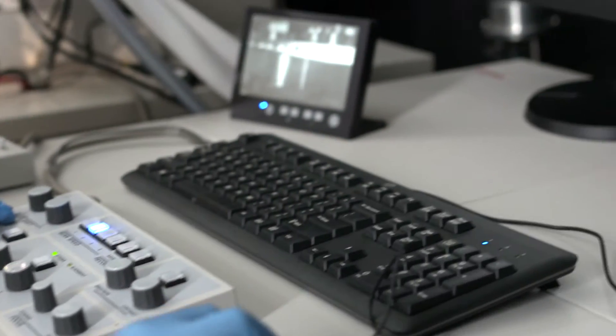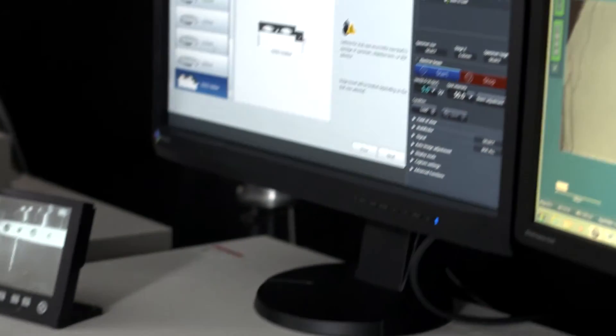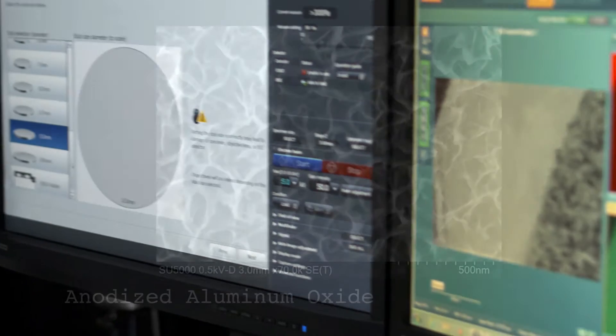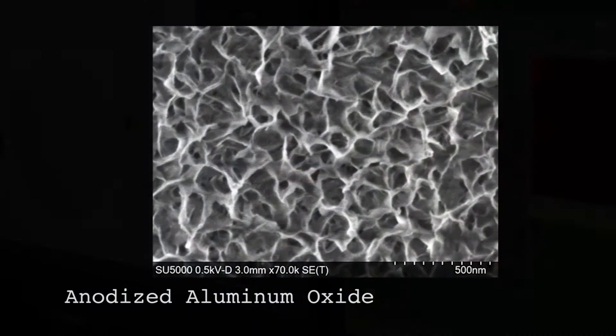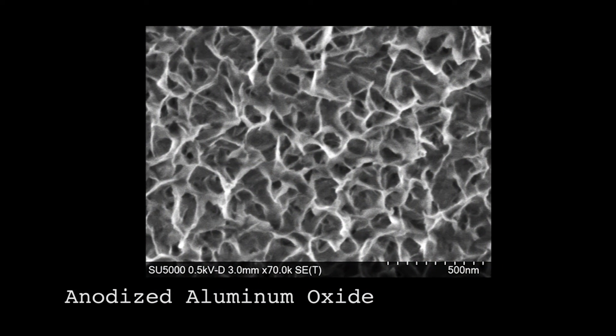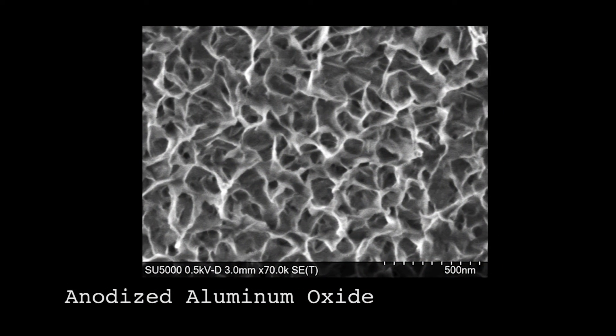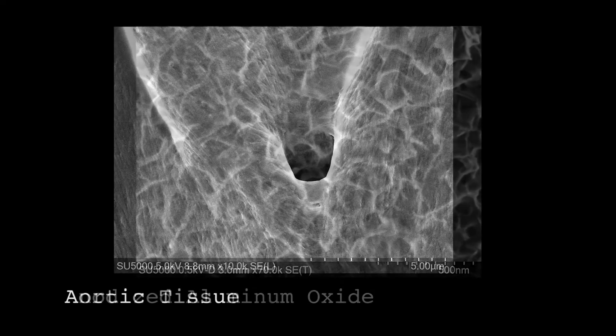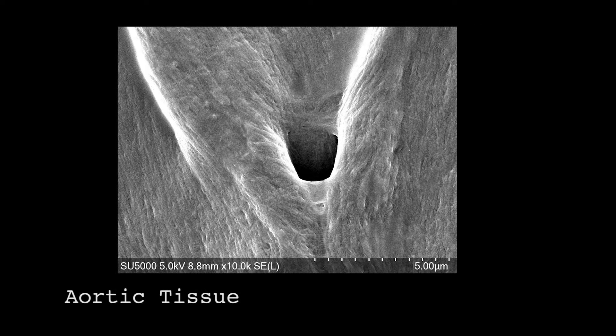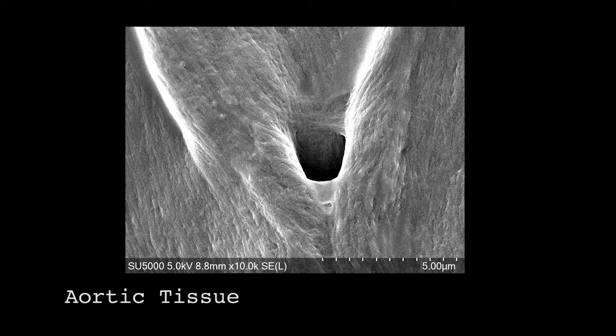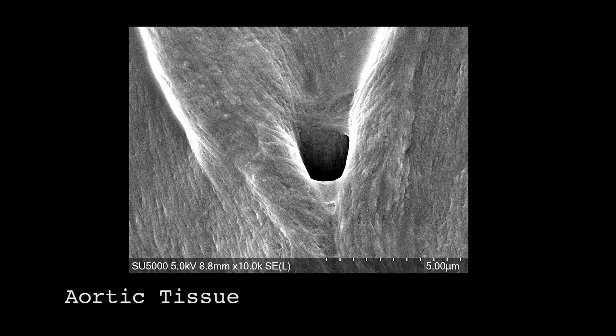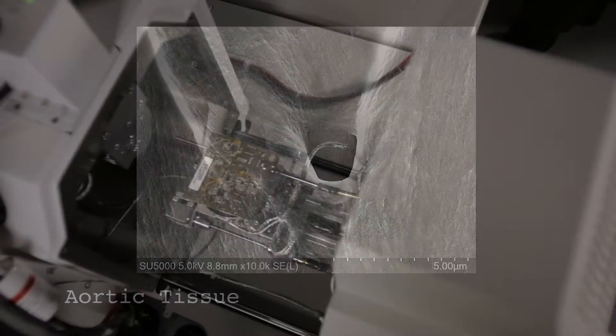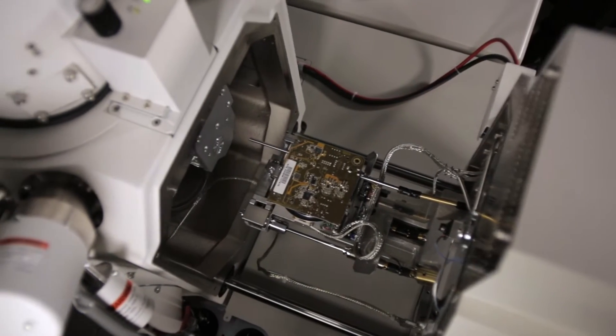The SU-5000 is equipped with a dual SE detector design for maximum flexibility and enhanced image quality, yielding higher brightness at lower voltages and at any working distance. The in-column SE detector, combined with deceleration technology, provides nanoscale imaging for a multitude of conductive and non-conductive materials.